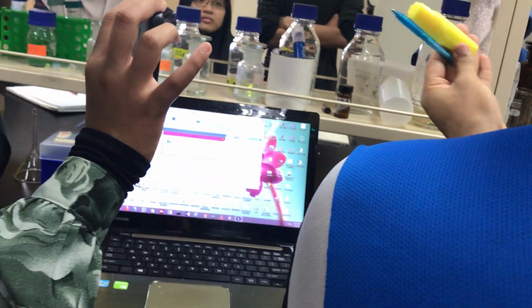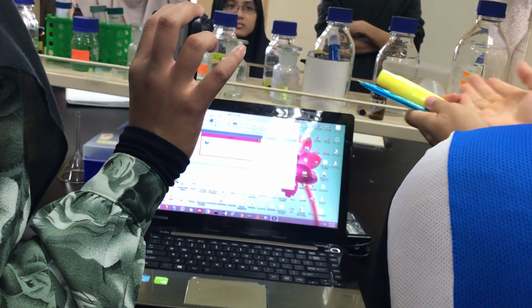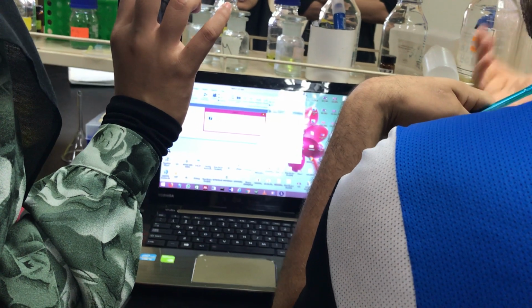If at the beginning the activity is the same, from the beginning the software will reject the data. That's why all above 90% at the beginning is rejected. But to write the report, I will propose components, but this component is also not significant.